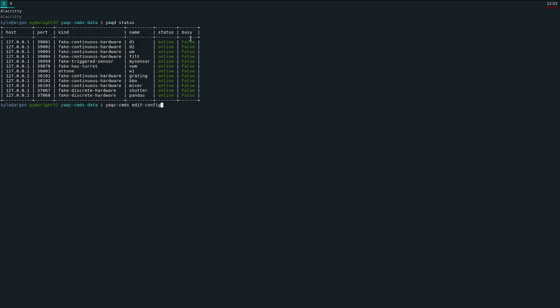Here on my system, you can see that I have a lot of running daemons, primarily of fake origin, which my system can connect to.